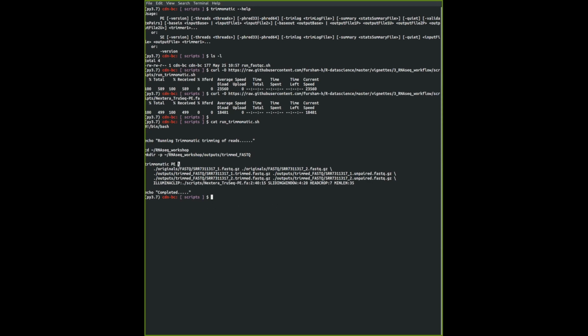You have to provide this backslash as a terminator to the previous line. So after PE, you follow by this backslash to tell the script that this is a continuation of the entire code. Because of this, you're able to write your arguments in separate lines and it looks a little bit neater.